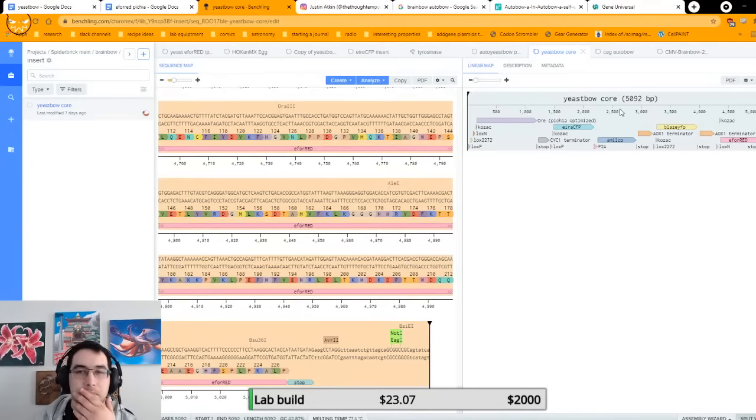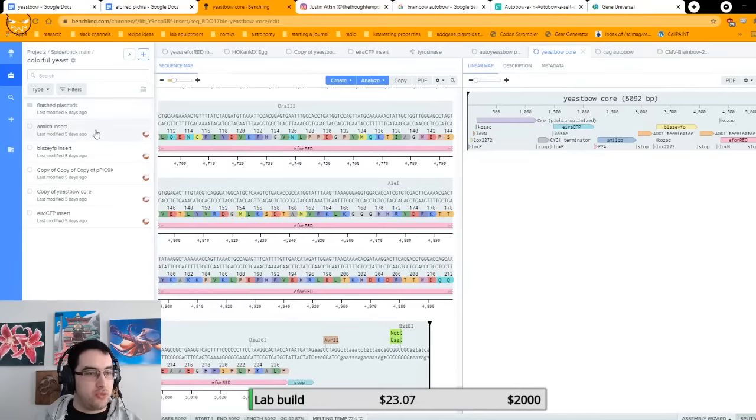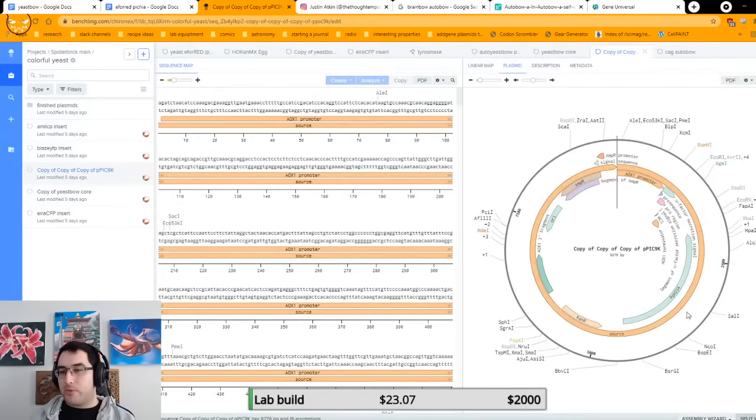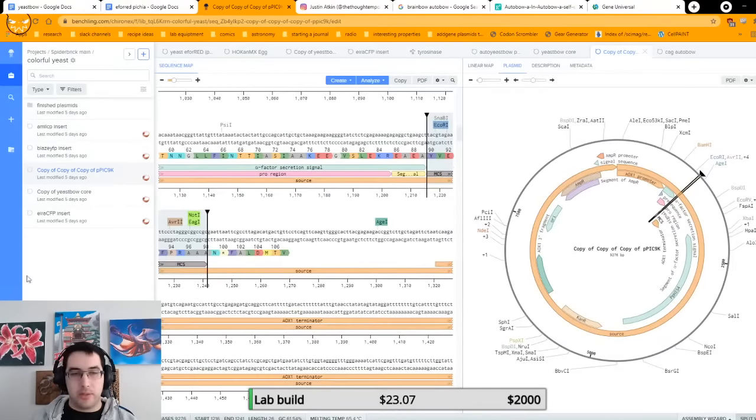Where would I have that? I don't know if I have a blank. Oh, I know where I would have a blank. Colorful yeast. Okay, this is the backbone. This is what it looks like before you put anything into it. So there's this little thing that says MCS. Might be a little hard to see, but this is called the multiple cloning site. So it's literally a little spot where they've put multiple restriction sites.